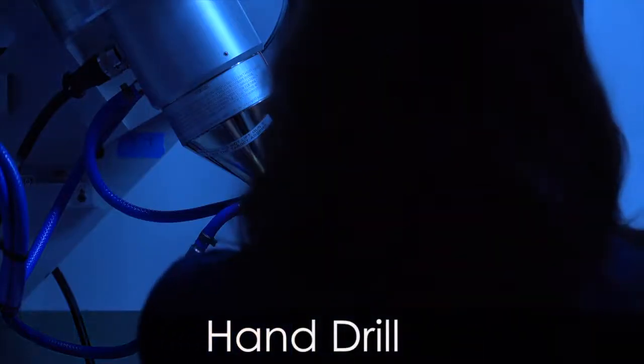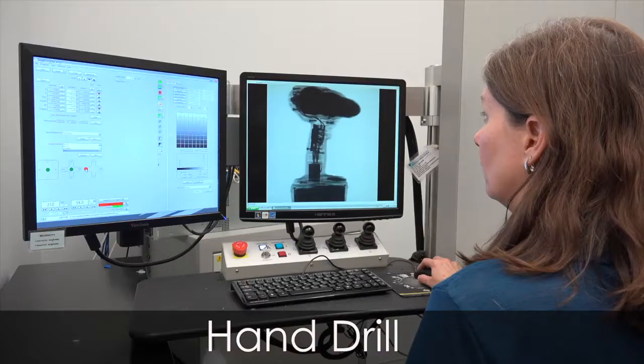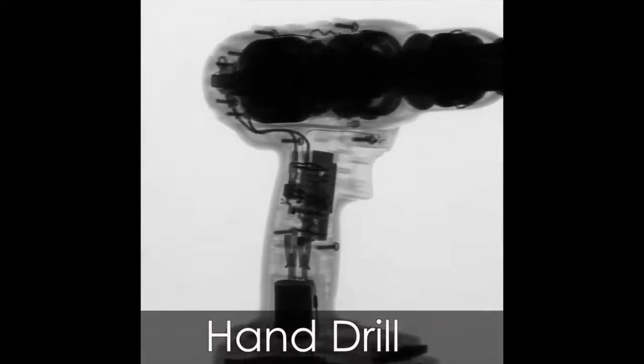Size is a limiting factor for the MicroCT. Samples wider than 25 cm will most likely be too big to fit in the entire field of view of the CT scan.